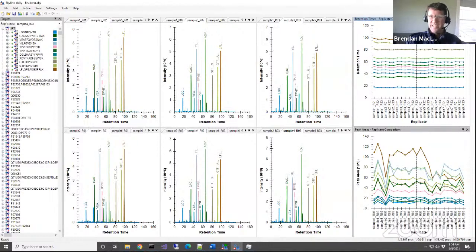Statistically, acquisition order on a mass spectrometer can be a confounding variable if you don't do the right thing. So what do we want? Randomization, yeah, right on, exactly. We definitely want to see some randomization. What's the other thing we want to see? Instrument drift is fine, we might see that, but that's not something we want to see.